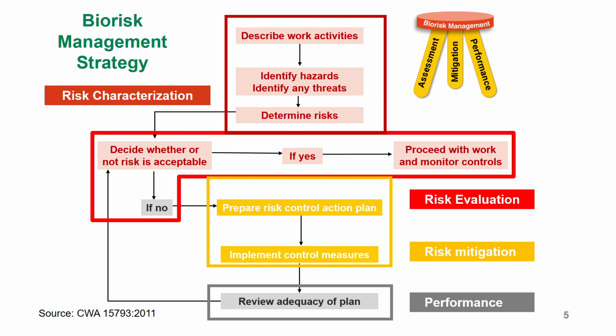But if at this particular point you find that you do not have the resources, you've done what you can as a lab to either reduce or try and reduce this risk or eliminate it. But then at this point, your budget is exhausted. You don't have any more money. You don't have anything more you can do at this particular point. Then there's the next step that you now need to do, or the next decision that you need to follow, which is the "if no", which is going down there.